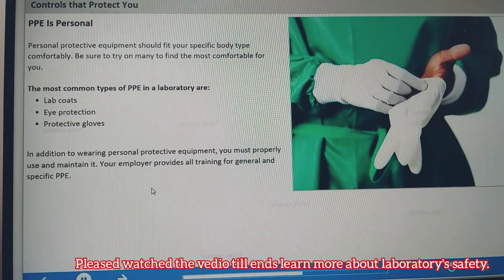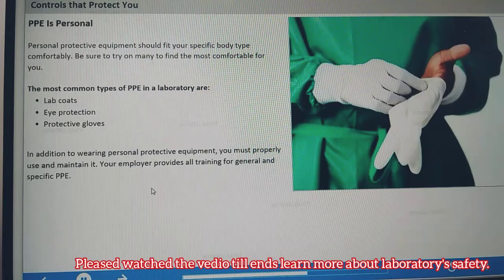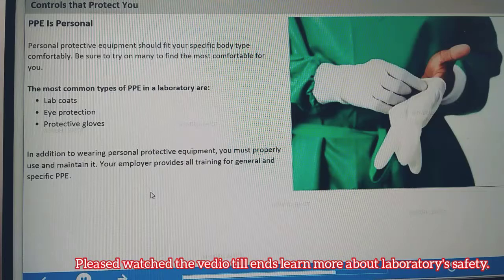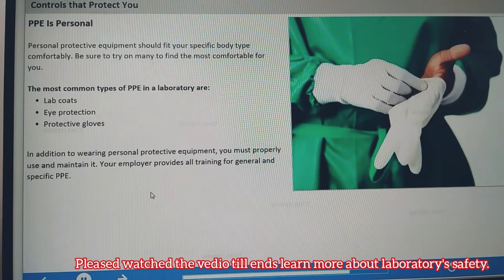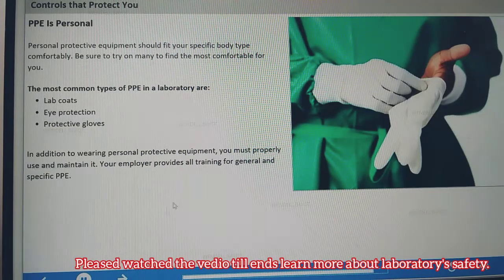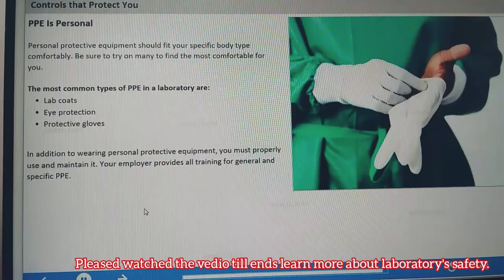You may be required to wear additional PPE such as face, hearing, head, and foot protection, as well as respirators when appropriate. In addition to wearing personal protective equipment, you must properly use and maintain it. Your employer will provide training on the use and maintenance of general and specific PPE.